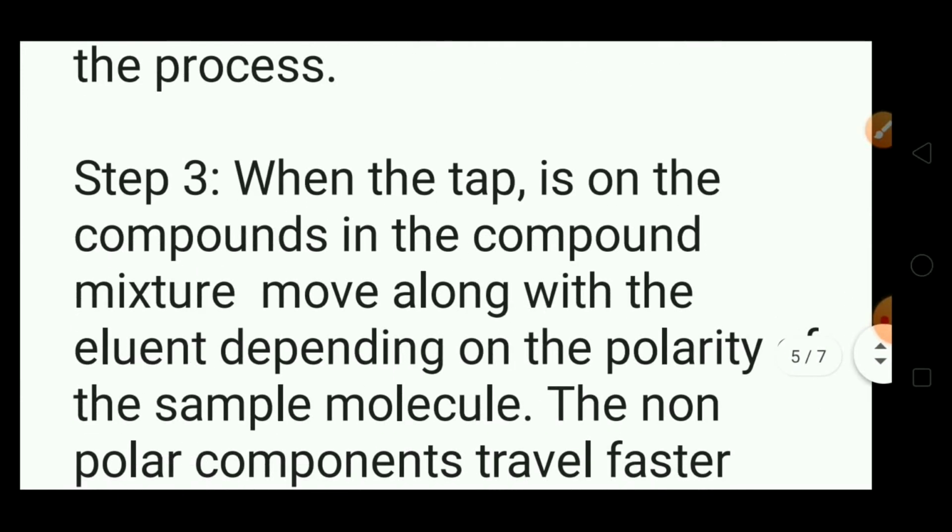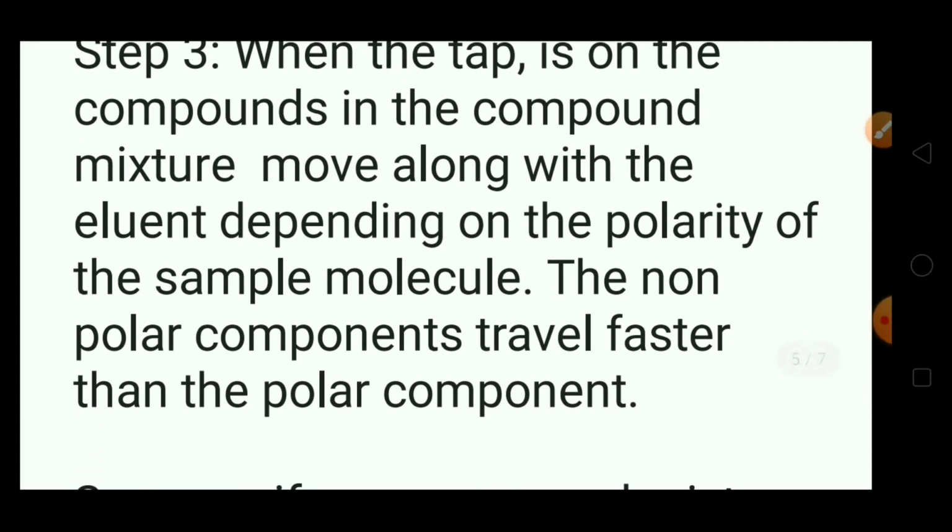Third step. When the tap is on, the compound mixture moves along with the eluent depending on the polarity of the sample molecule. The non-polar components travel faster than the polar components.